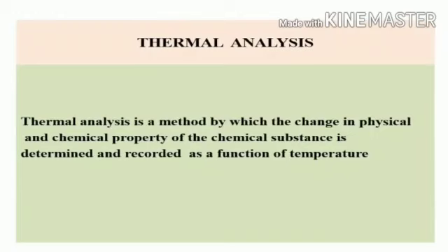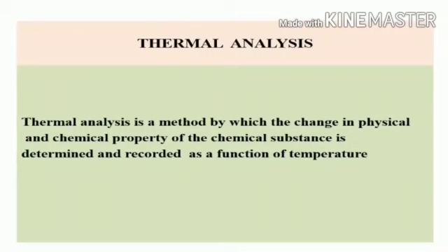They occur at widely varying temperatures depending on the material involved. Chemical changes such as decomposition or reaction may also take place at different temperatures. The physical and chemical changes that take place when an unknown sample is heated provide us information that enables us to identify the material.